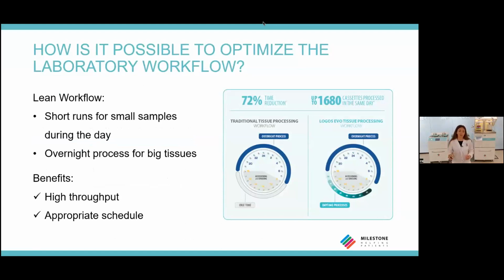And the longer process for thick and fatty tissues during the night. So this kind of organization can increase the overall productivity and also gives the possibility to process small samples with the appropriate times, as we previously saw.